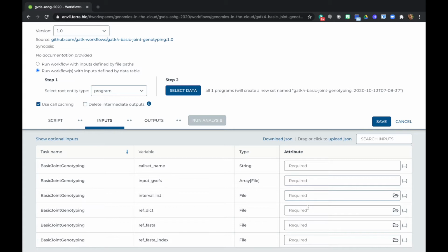That takes a little more effort to set up initially, but then afterward, it's easier to fire off additional invocations of the workflow. It also helps a lot with dealing with very large cohorts. Today, I'm going to show you how to do it both ways, because they're both useful and it's important to understand the difference between them.